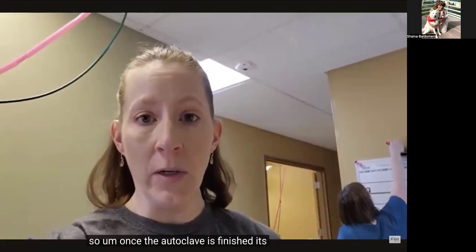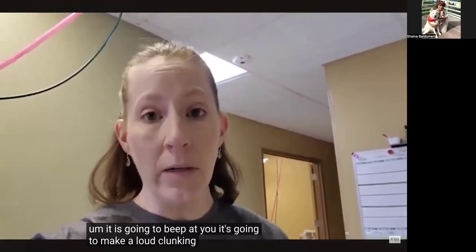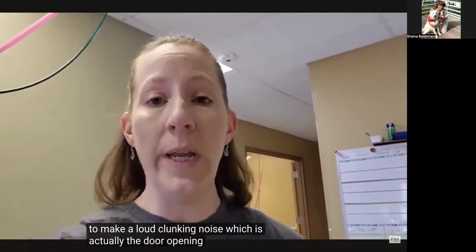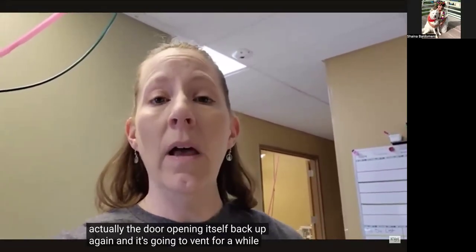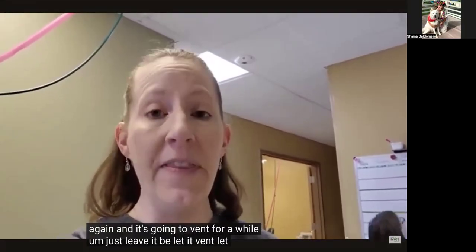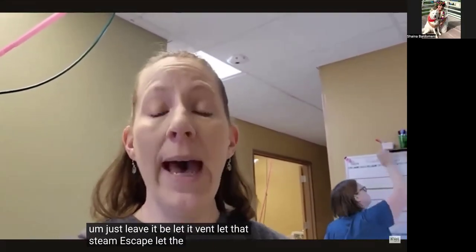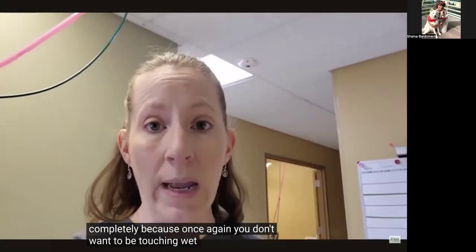So once the autoclave has finished its cycle, it is going to beep at you. It's going to make a loud clunking noise, which is actually the door opening itself back up again. And it's going to vent for a while. Just leave it be. Let it vent, let that steam escape, let the packs cool down completely. Because once again, you don't want to be touching wet packs.